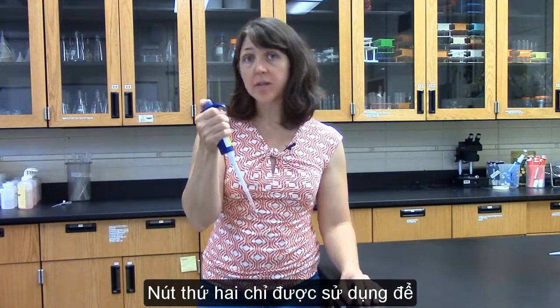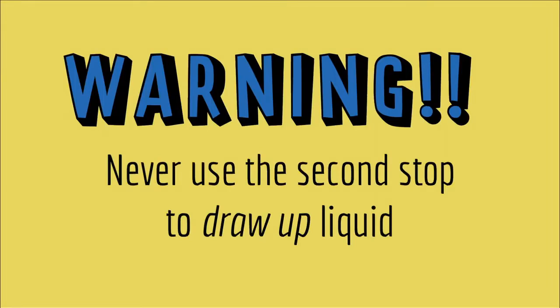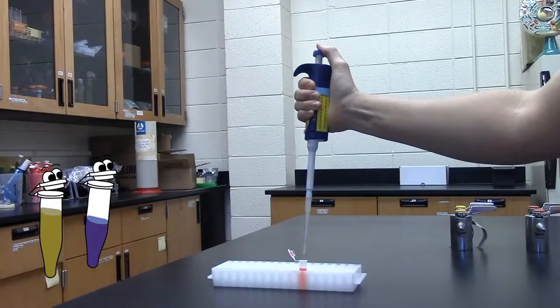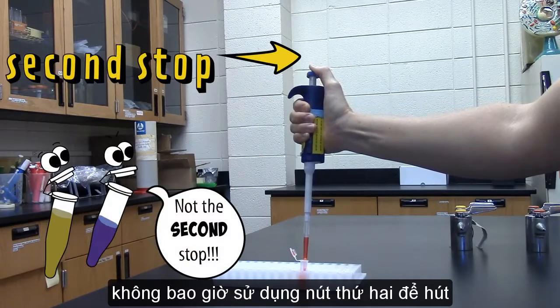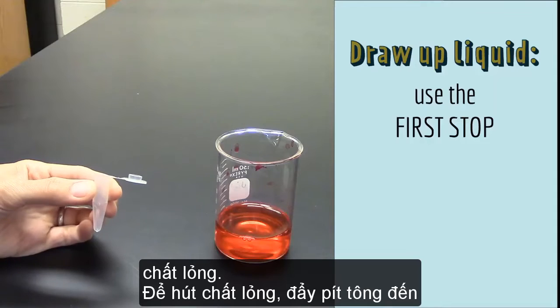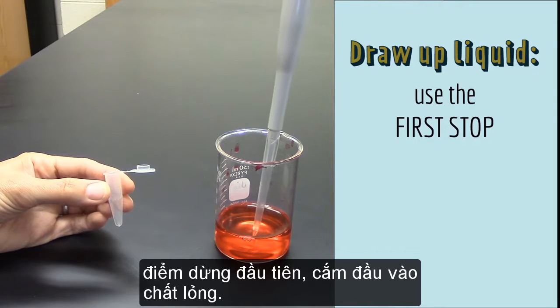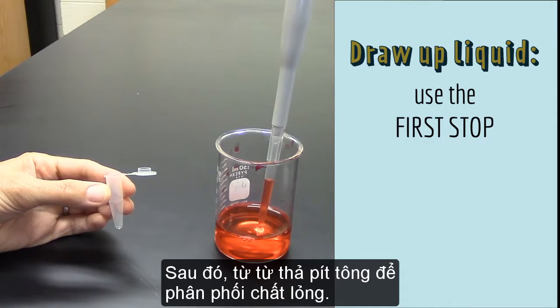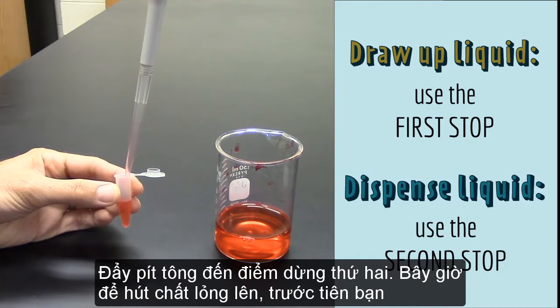The second stop is used only for dispensing liquid, which means never use the second stop to draw up liquid. To draw up liquid, push the plunger to the first stop, insert the tip into the liquid, then slowly release the plunger. To dispense the liquid, push the plunger to the second stop.